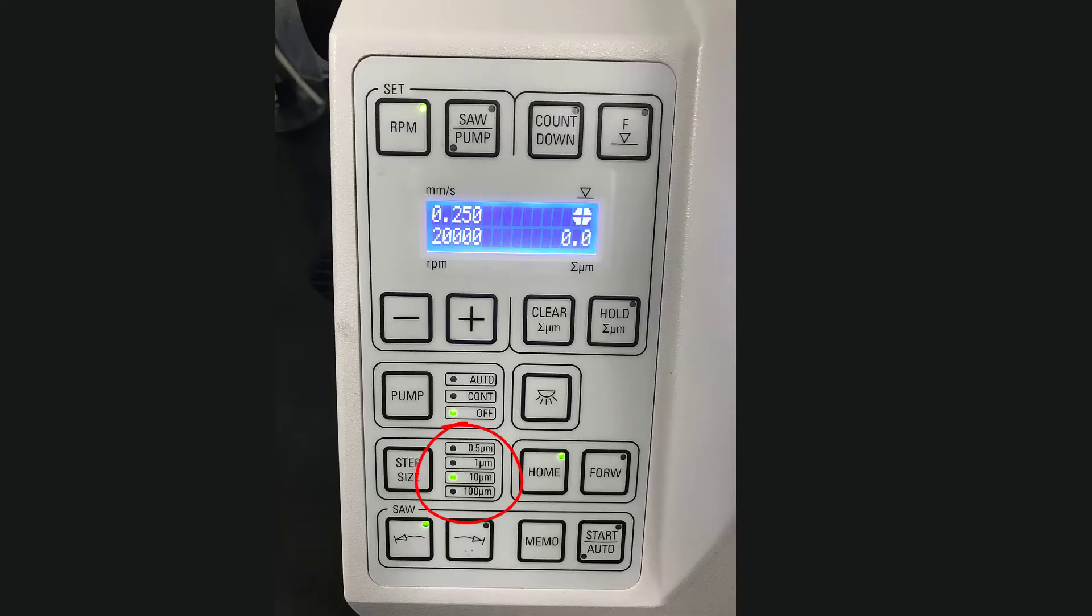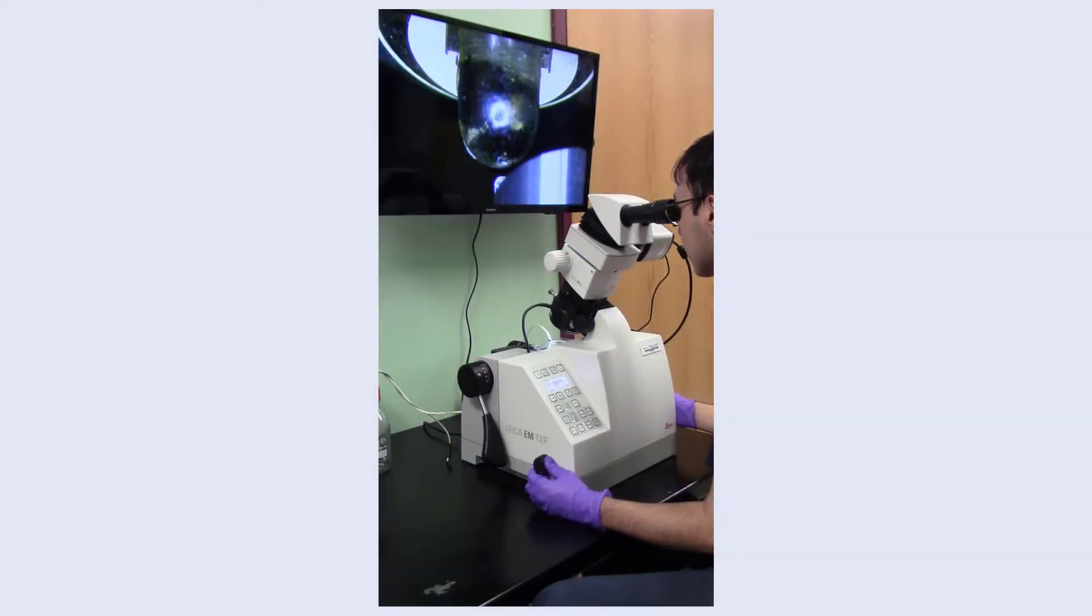Change your step size to 10 micrometers for a finer approach and, using the control lever, make a full pass at the sample by slowly lowering the control lever. Then advance using the feed wheel and repeat until you scratch the surface of the sample or feel a slight resistance by the control lever.